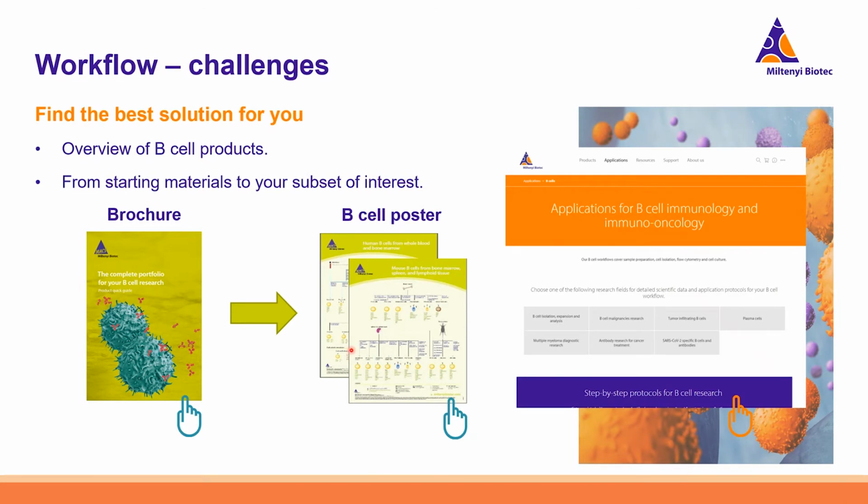And also we have some nice application pages for the B cells where you can look into all the different workflows we have for the B cells to get more information on example data, what to expect, what the steps are, and where I can find some help.